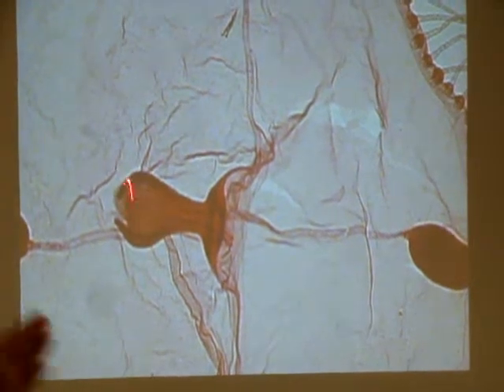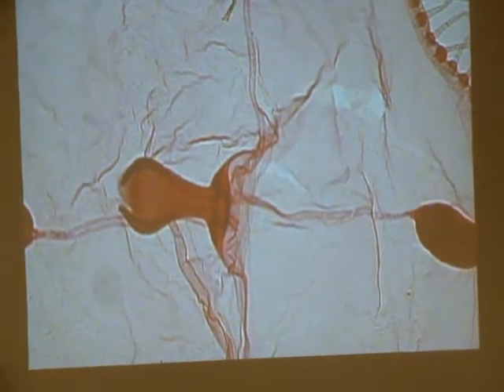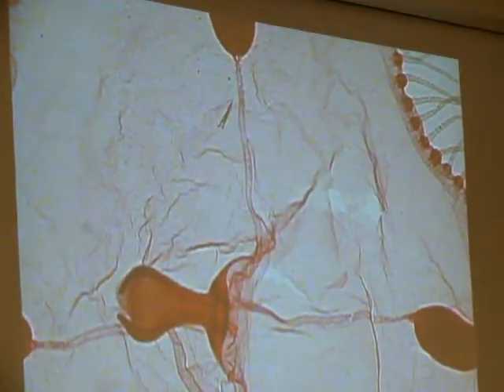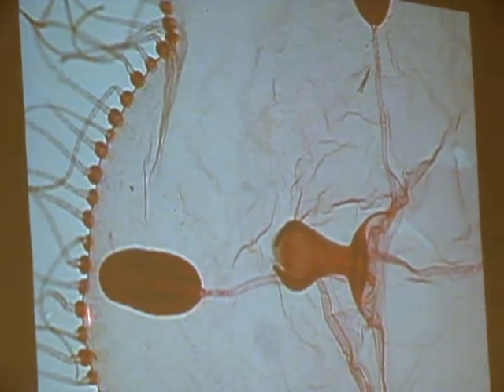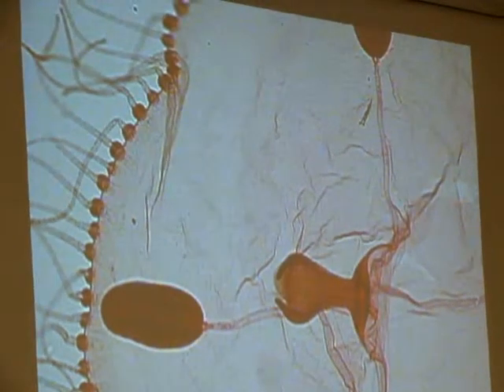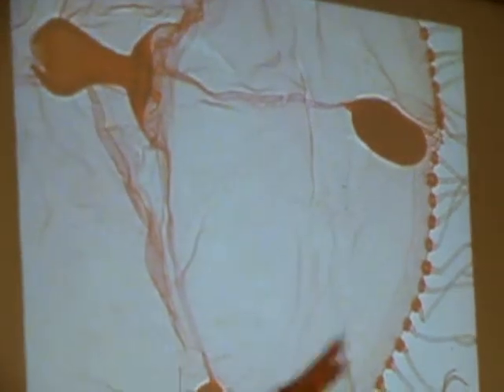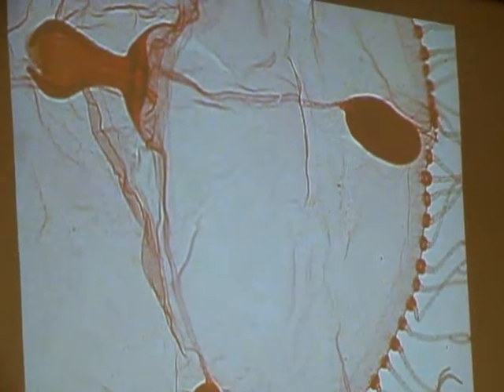What's this object? Mouth? With me? How about these lumps? And this part, the part that connects it, is the radial canal. Remember the radial canal goes through the center. Looks like the radius goes through the center. So what's the edge called? And these things hanging off are tentacles. What is that edge called? The photograph is 82. Parts are on 84, photographs on 82.